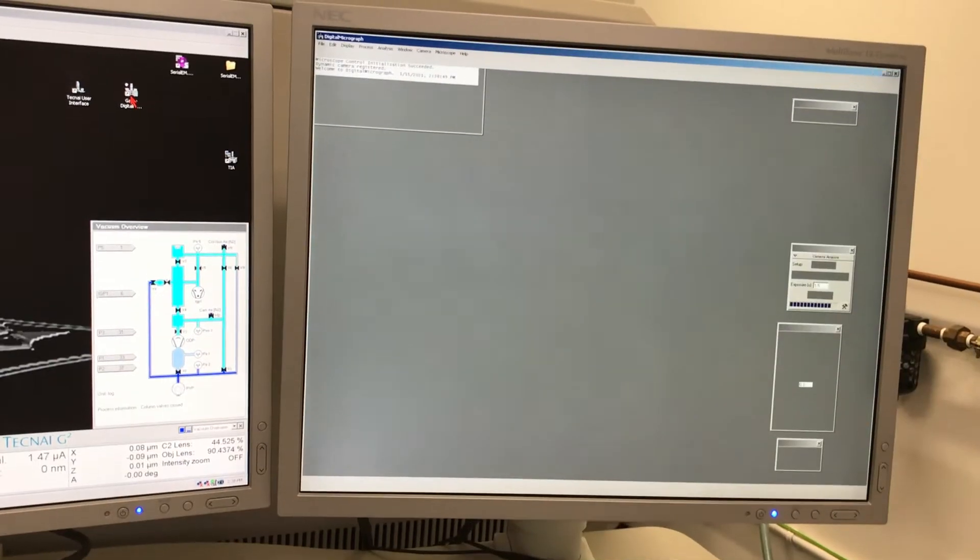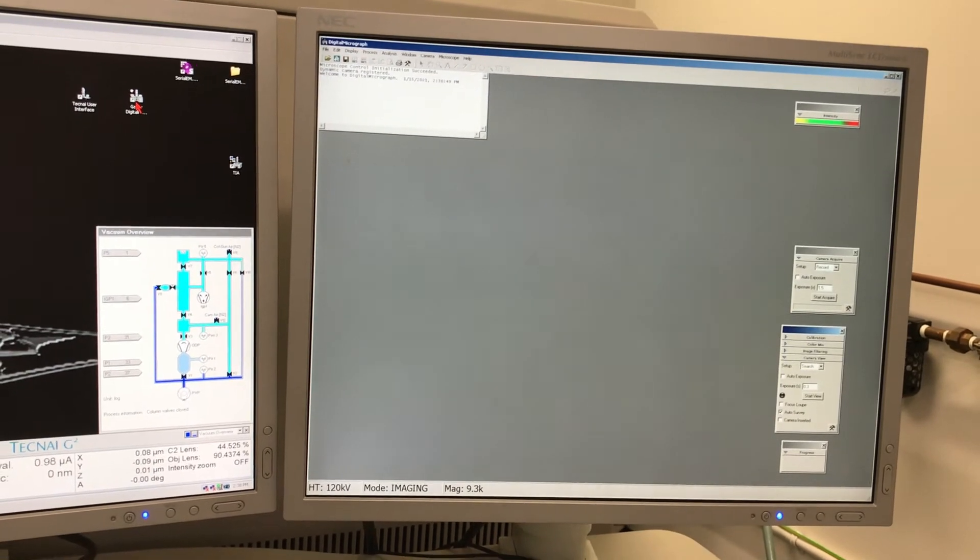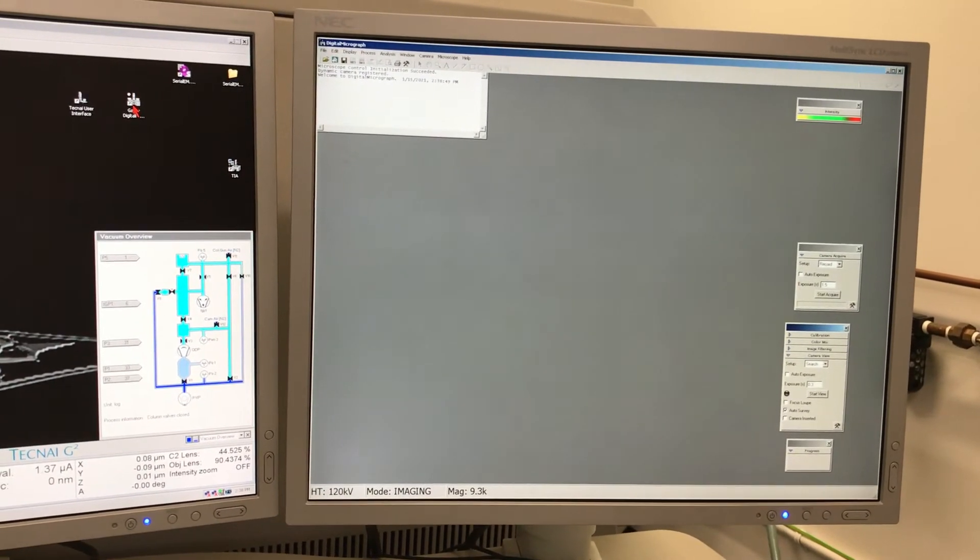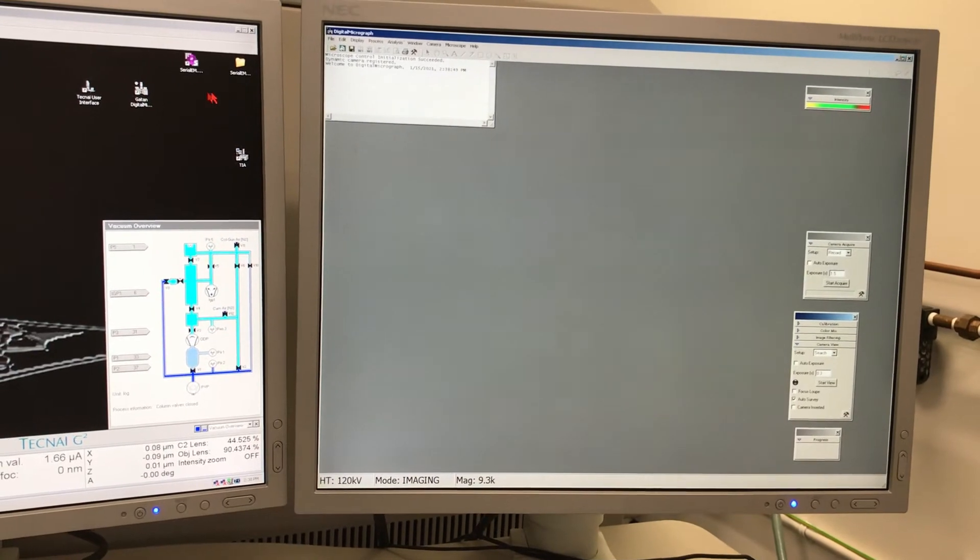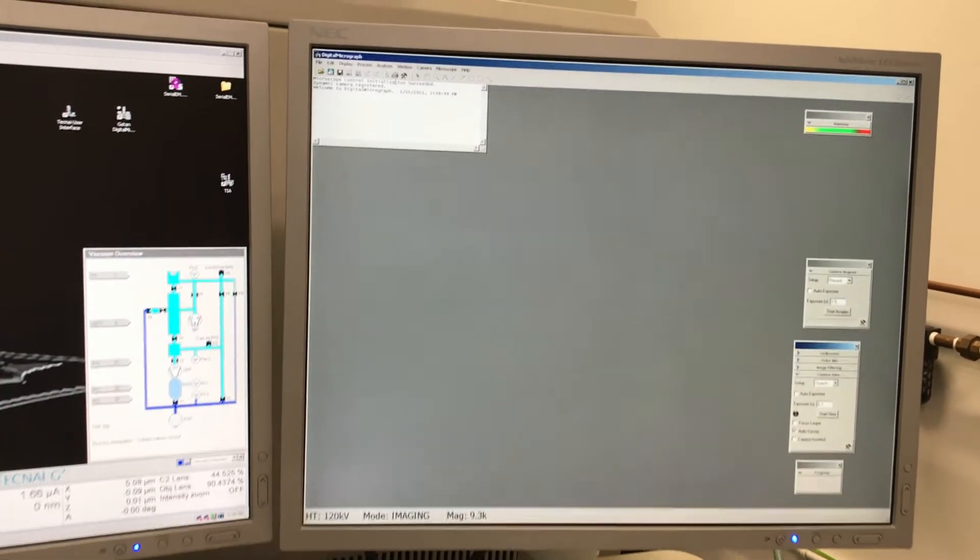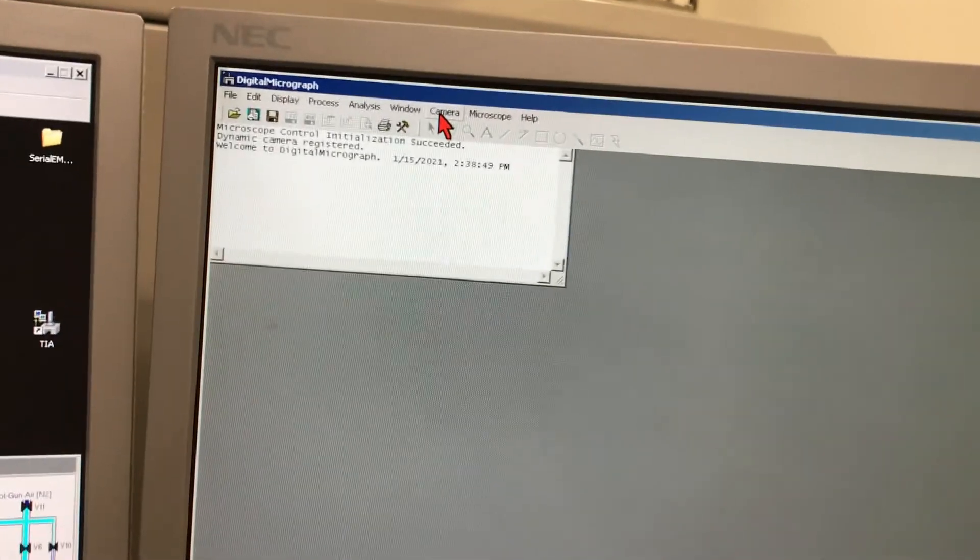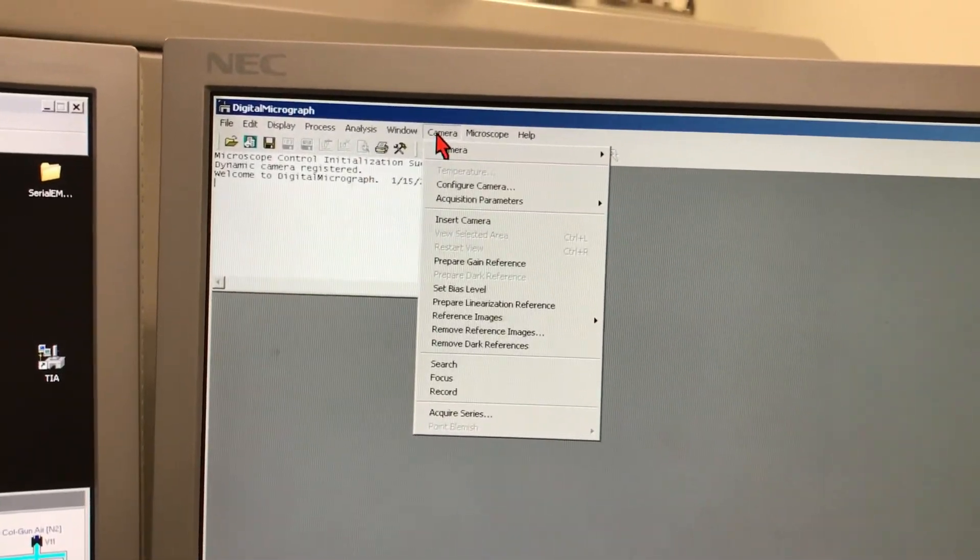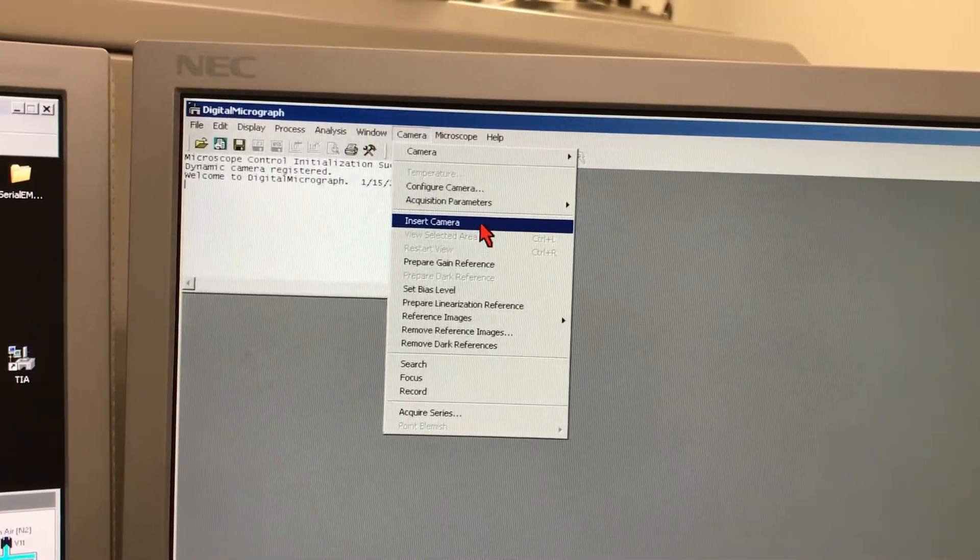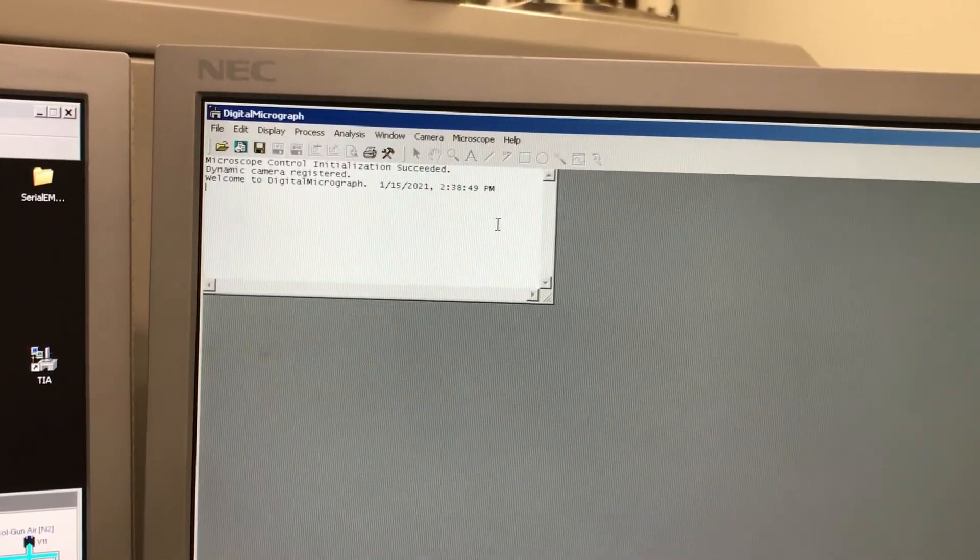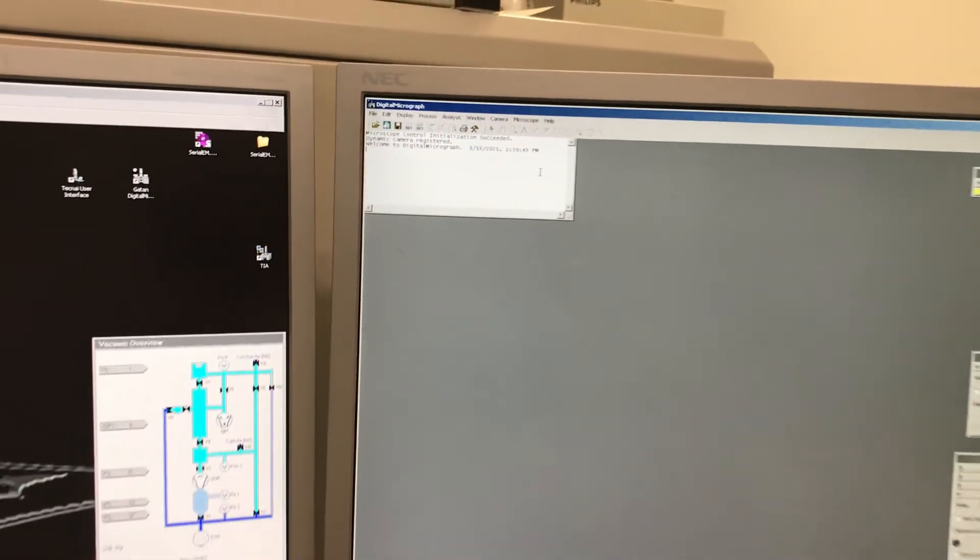For this we need to open the program called Digital Micrograph, because it has the control for our camera on the microscope and is also an important component of communication between another program known as SerialEM, which we will be using to take the images from the grid.